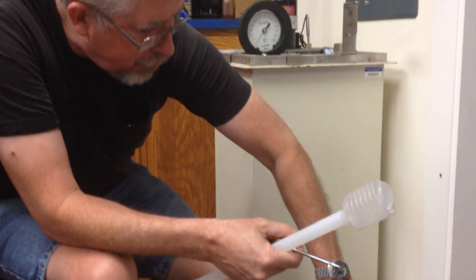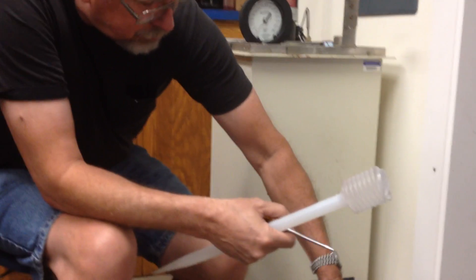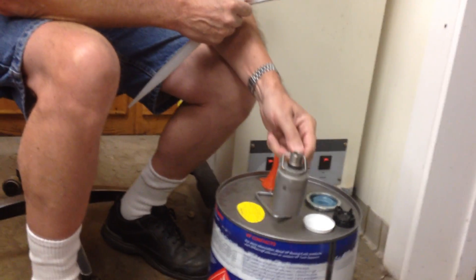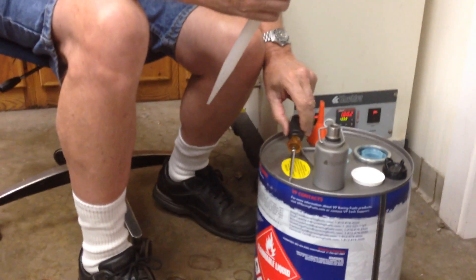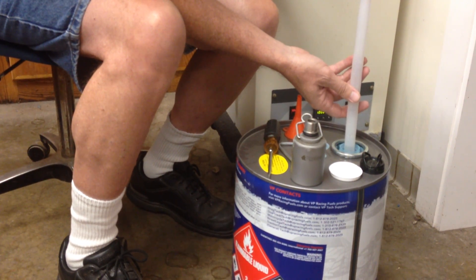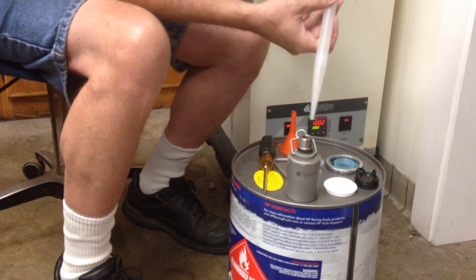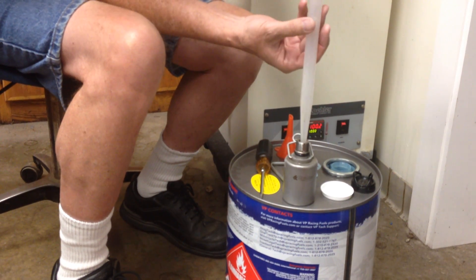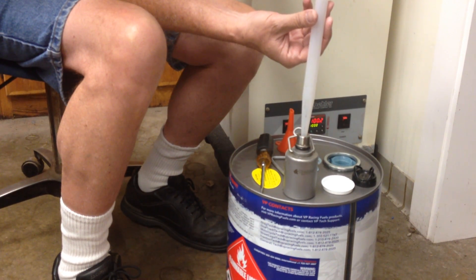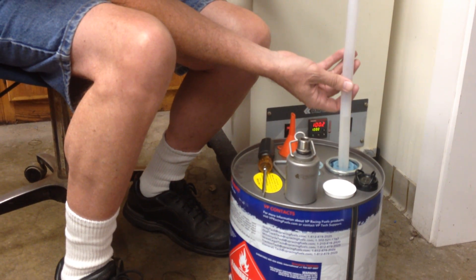That preheats the air in the upper chamber. And this is the sample container that's chilled — it's been in the refrigerator. The reason it's got to be chilled is so we don't lose any of the fuel's front ends before we test it.